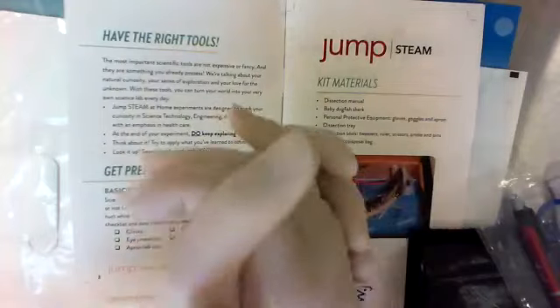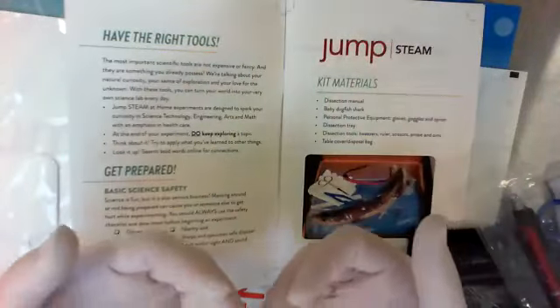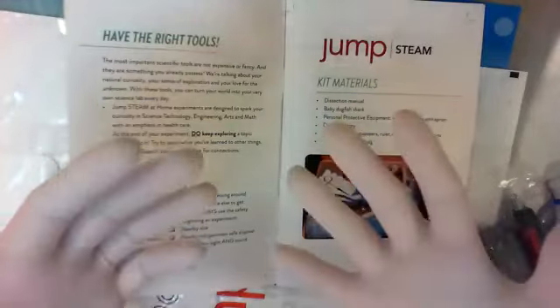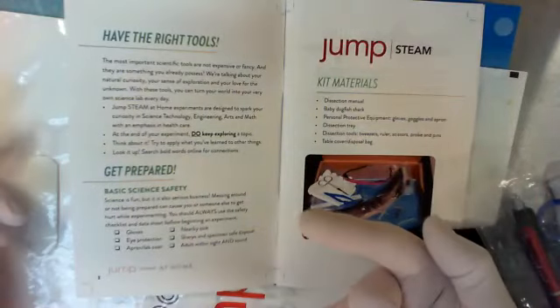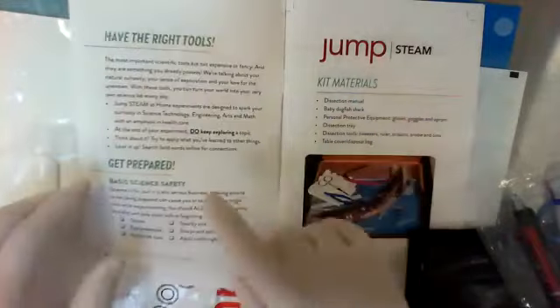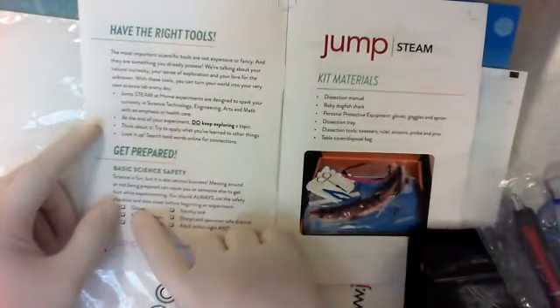Ziploc bags are great because they're clear and you can see where your fingers are. And I'm not saying that because I don't want the formaldehyde or formalin on your fingers. It's because it smells. It's stinky. That fishy smell, if you get it on your bare skin, it's going to stay like that for days. So if you rip your glove and you keep using it, when you go to pick your nose, you're going to smell that fish. And it could be good, then you don't pick your nose anymore in public. But at the same time, you don't want that smell, because other people can smell it even when you can't.